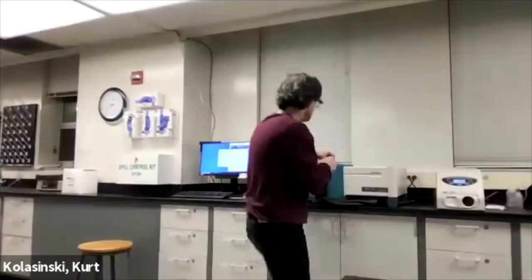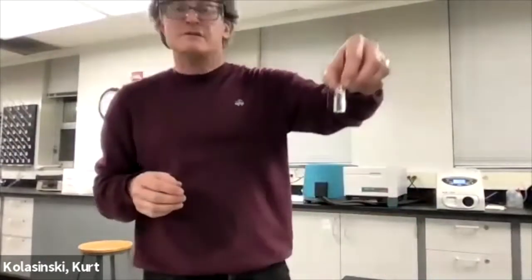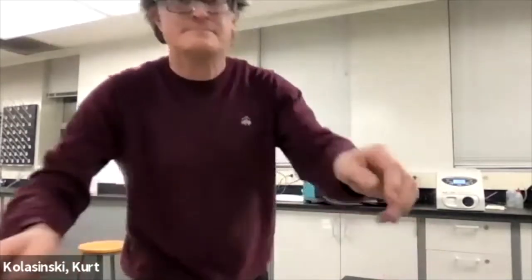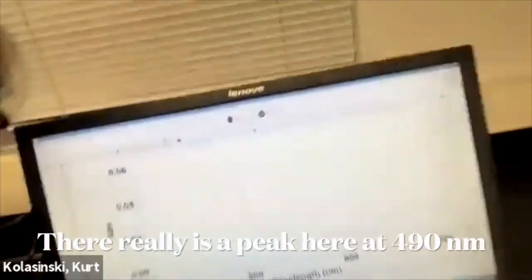So what do we do? We have a solution that we want to measure the fluorescence of. We have to excite it with a photon. Where are we going to excite? What we have to do is we're going to have to take an absorption spectrum because you have to excite the molecule where it absorbs light. And that I've done. Just a regular UV-Vis spectrum.